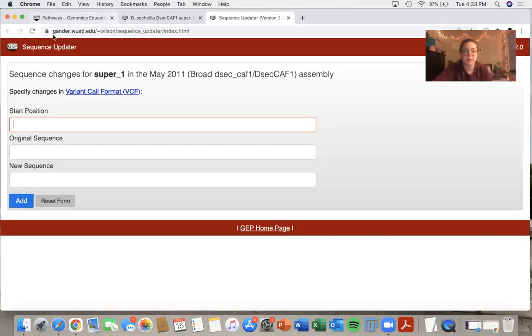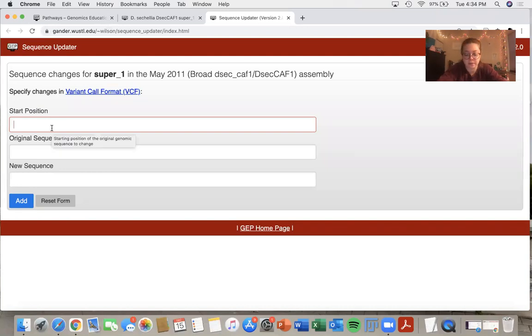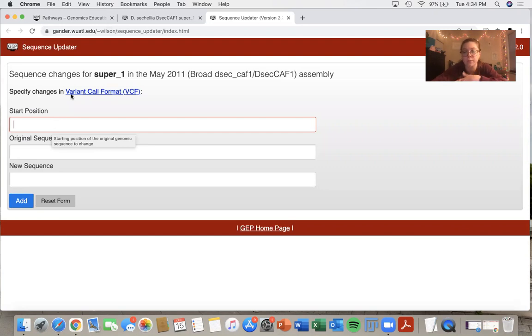And I will first show you a change of base. So in the start position, that's going to indicate where I want to start changing my bases.